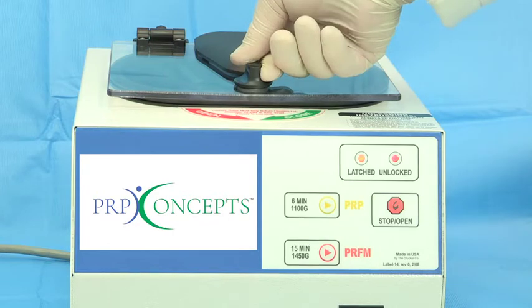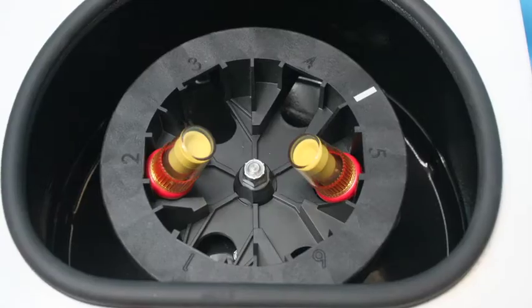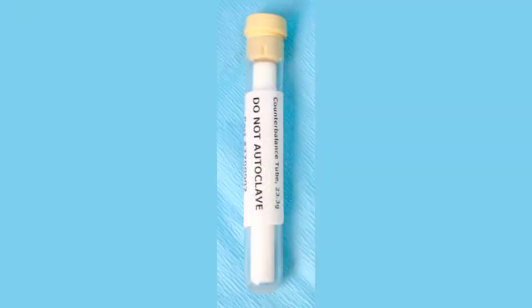When using the Drucker centrifuge, push the yellow PRP button. Place tubes opposite each other prior to centrifugation. Use yellow tube counterbalance when necessary.